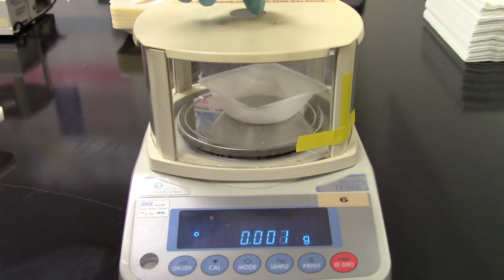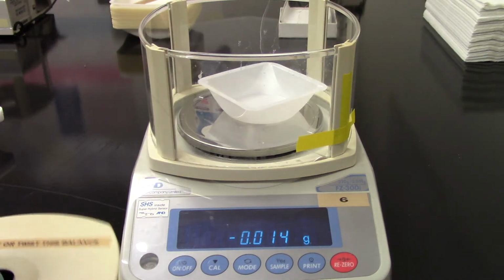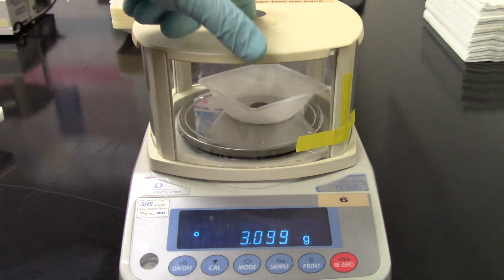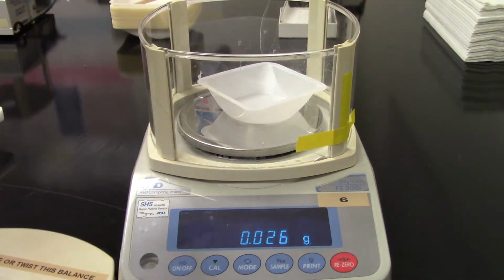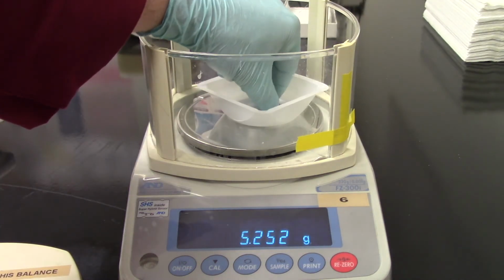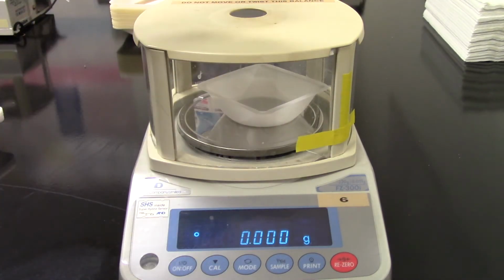Make sure that's okay. This one is 1960. The next one is 2017. And it re-zeroed, that's good.